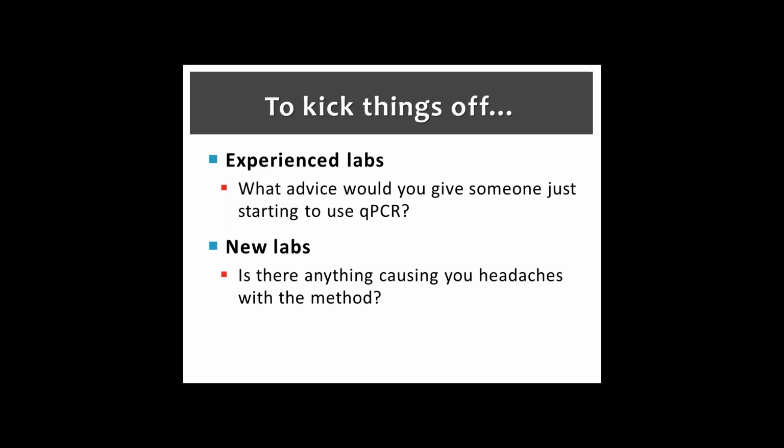I think it's maybe doubling the cost of the Enterococcus methods, with all those additional materials you need for additional purification steps and so forth. Did you say you needed an additional probe, or did I misunderstand? Yeah, every target that you're targeting, that's how you target it, by having it in the primer and probes.